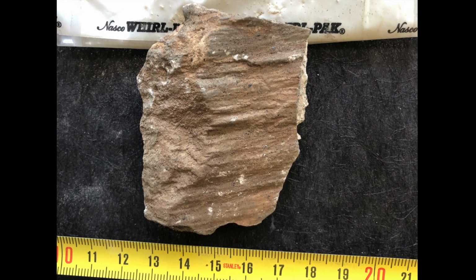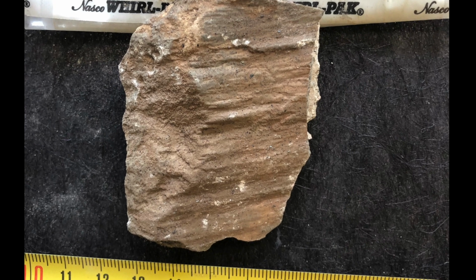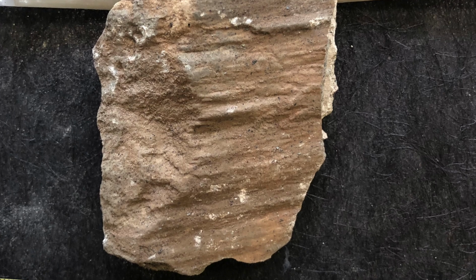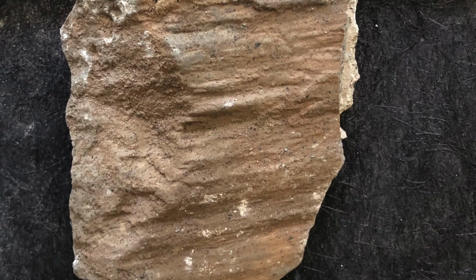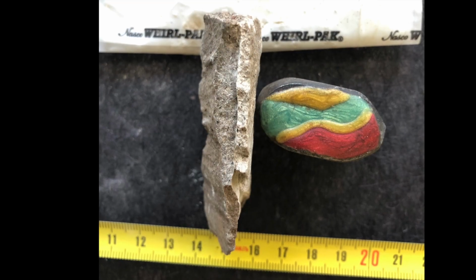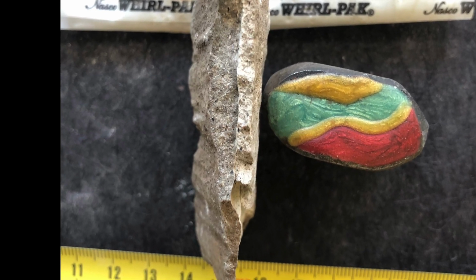But before we can make isotopic measurements, we must first make physical observations of the sample and prepare it for subsampling for isotopic measurements. This view shows the upper surface of the sample with lineations parallel to the direction of ancient ice flow. This view shows a cross-sectional view revealing two distinct layers.